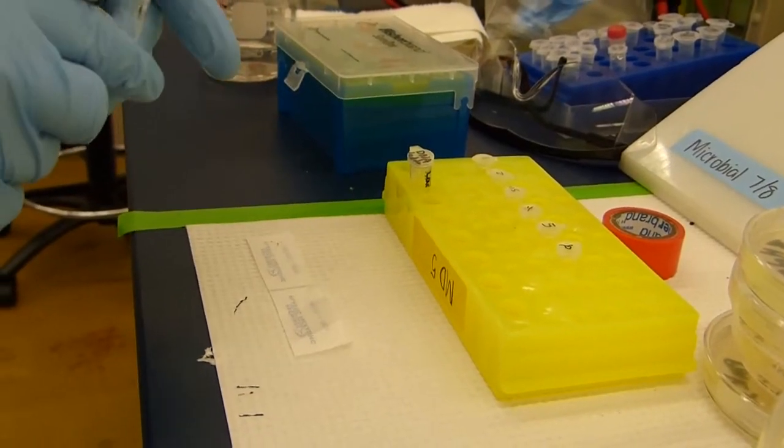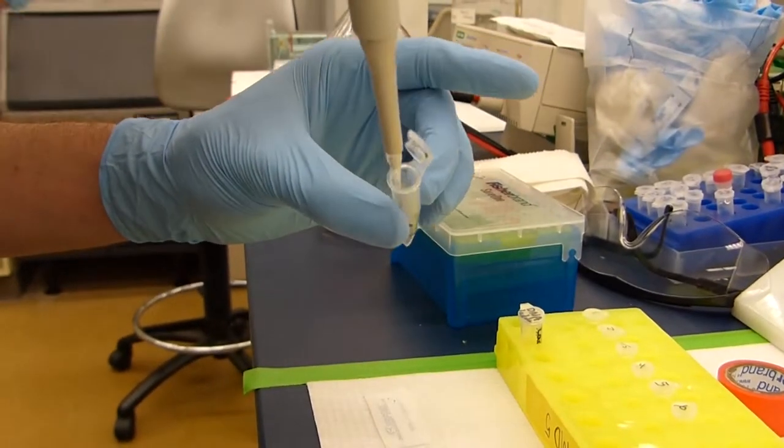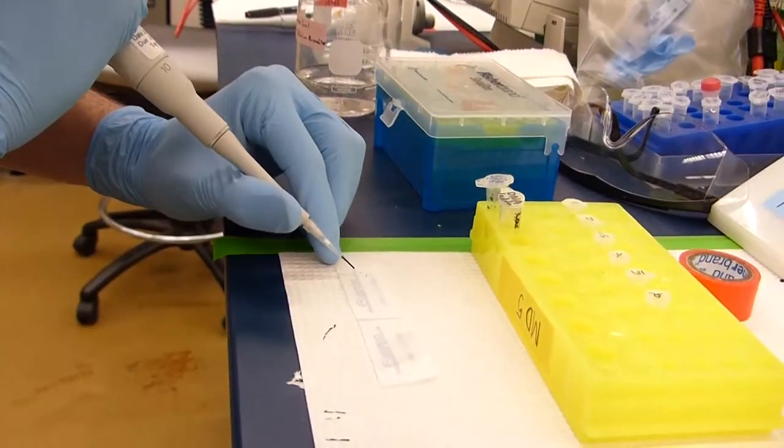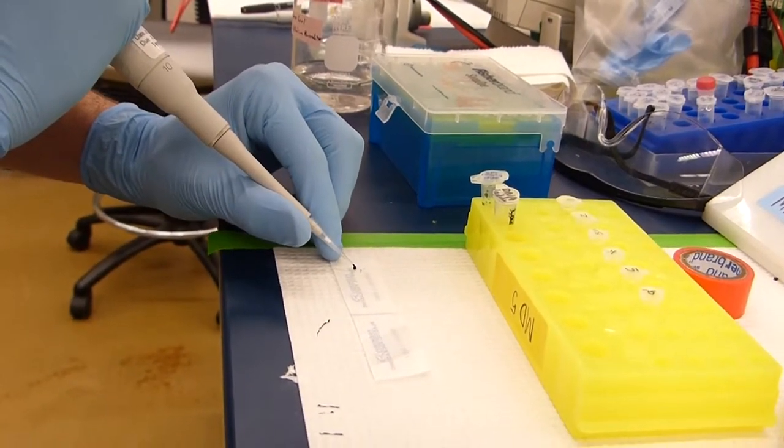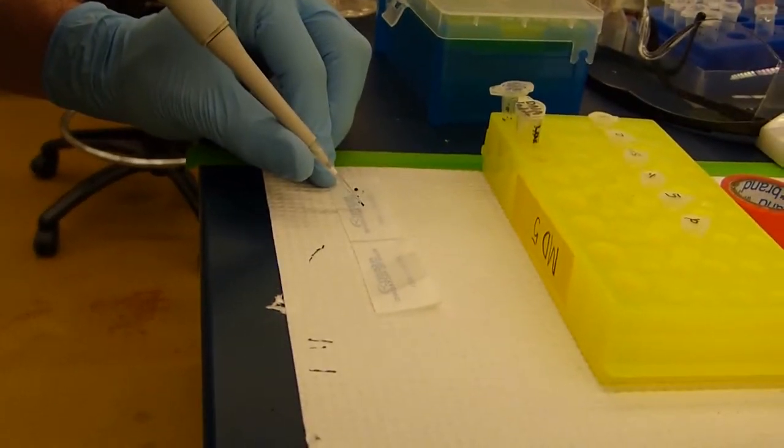From here, you will make small dots of the loading dye on your strip of parafilm. You can keep the pipette set to 3 microliters and usually get 3 or 4 small dots out of about 3 microliters. Also be careful to space these out as you do not want to risk mixing them as you go along.